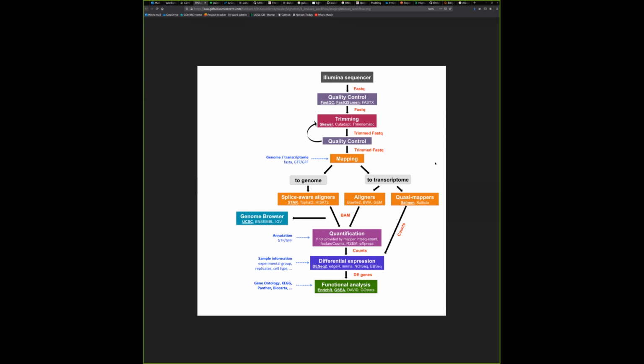Again, I hope you get a feel of how the installation works. Some of these tools are easy to install, especially if they are available on Conda, so it's much easier. Some tools are a bit more difficult because they require you to build from source, basically using the raw code and installing it onto your computer. If you face that sort of problem, try to read and follow the code step by step. If not, at any point of time, if you have problems with any installation, just let me know and we can troubleshoot any tools that you are trying to install.